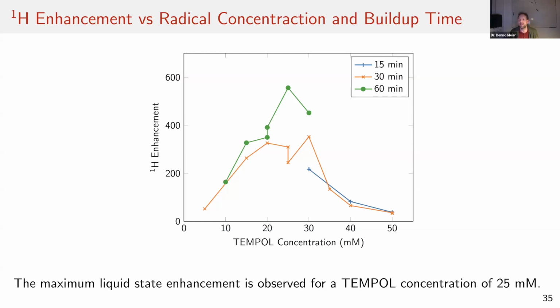So whatever else we had before, we lose. And proton polarization levels in the solid are also a bit difficult to estimate because you have background signals and so forth. But I think a number of 80% wouldn't be unreasonable. So it's still like you lose a lot.